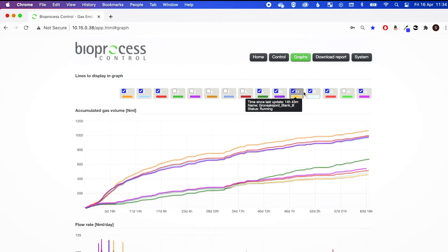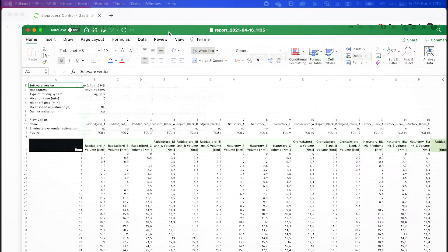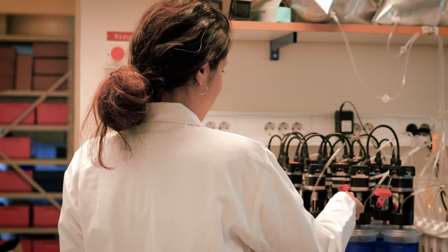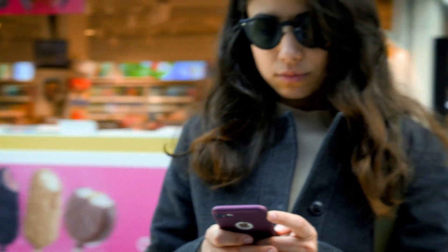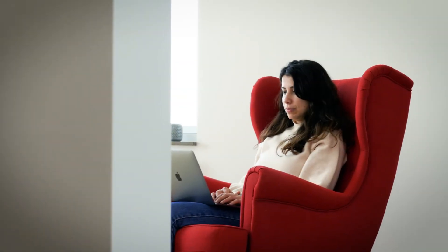Follow the experiment in interactive graphs and download and export your results as Excel reports. Gas Endeavour can be accessed from anywhere you have an internet connection. So whether you are on the run, at the office, or at home, you can always follow your experiments.